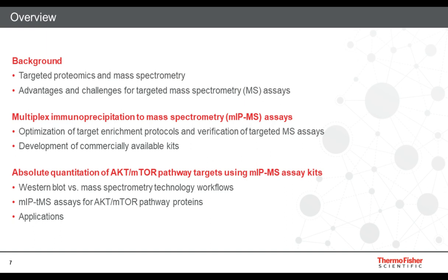So in the second part of the talk, I'll talk more about how we develop these multiplex IP-MS assays. And I'll start out with optimization of the target enrichment protocol and verification of these targeted mass spec assays, and then development of the commercially available kits.